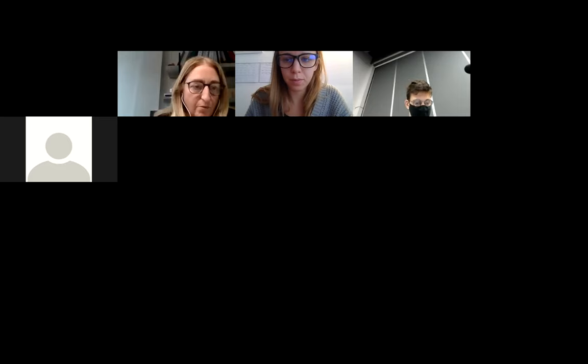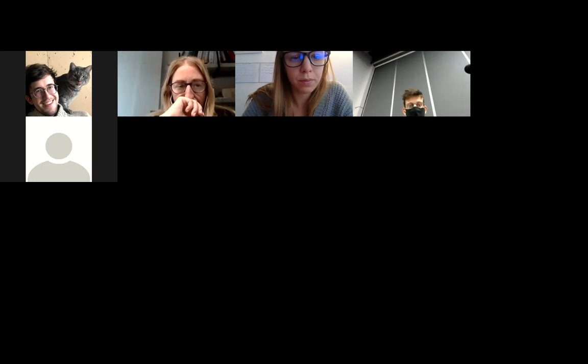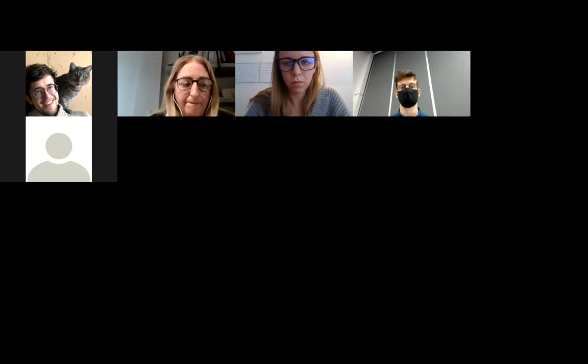One hand. Yes, Taylor, go ahead. Yeah, hi. I may have missed this in the presentation, but how thick does the sample need to be for these kinds of methods? I'm asking because in my lab, we use a slightly different, also X-ray based type of analysis for samples where we've taken a gas and passed it through a filter, and then we analyze what's impacted on the filter. I'm just curious about your method that you've presented here.